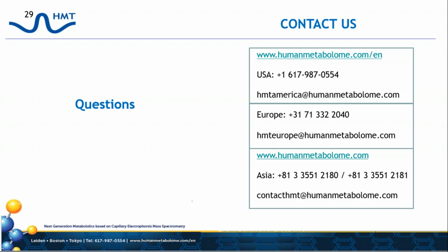Another question we have: are all of our labs for analysis in Japan? Currently, all of our analysis labs are in Japan. We do offer shipping from our regional offices, so samples in the northern hemisphere get sent to Boston, and in Europe go to Leiden, and then we handle all the shipping of the samples directly to our lab. Usually that takes 2 to 3 days. Those clients can ship directly to Japan if they want to.